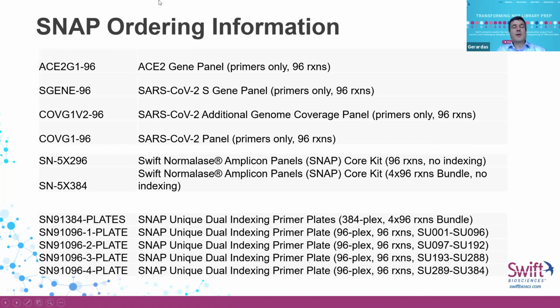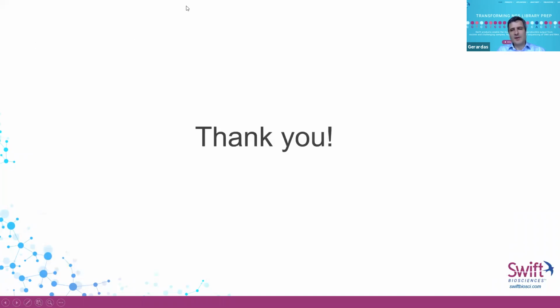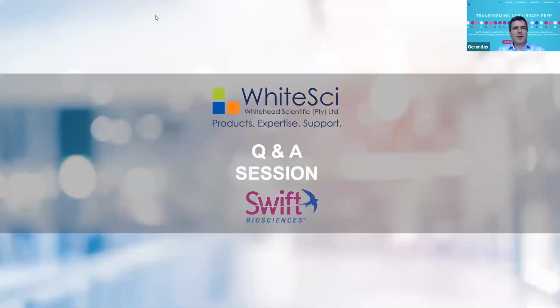And just going back to your cDNA, you end up with so little cDNA, almost unmeasurable, that any Qubit readings or any fluorimetric methods would not tell you the cDNA concentration. I spent 7 years in the lab, so I worked with cDNA a lot, not with viral cDNA, but with very low amounts of cDNA. So sometimes you just go straight into the PCR without measuring the cDNA.